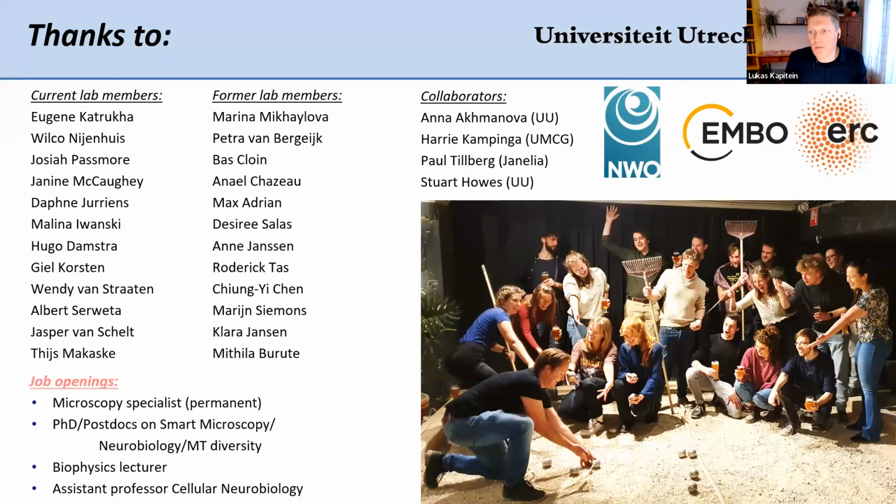And you might miss a subset. So I think that's why we developed MotorPAINT, because we wanted a method that probes microtubule orientations and microtubule mass in one method, so that we would not be biased towards one subset or another. It's a good question. So in a first order method, if you want to just probe whether my network is uniform or mixed, then if you only find comets moving outward, it's a good indication that it's mostly uniform, but you have to realize that you might miss a subset of stable microtubules that don't grow and might have an opposite orientation.